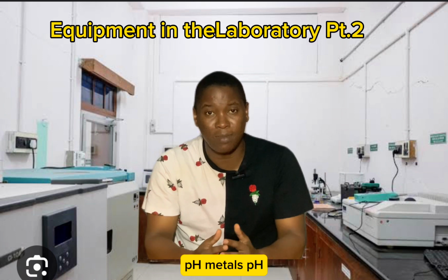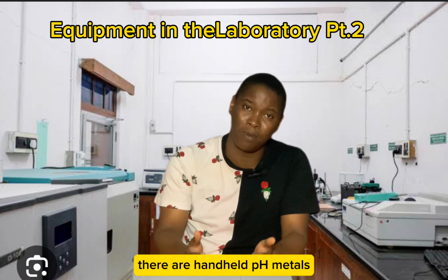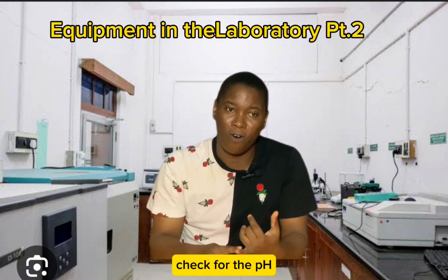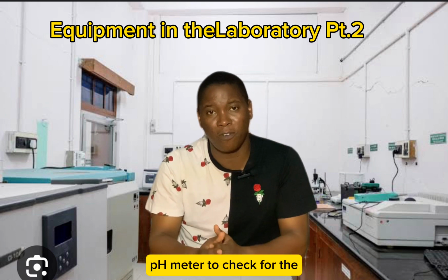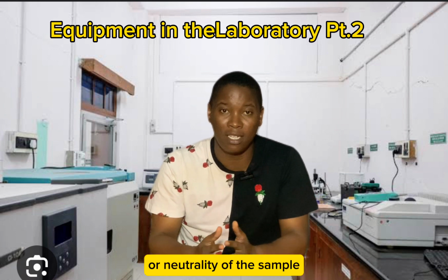Now, we also have pH meters. pH meters are important. There are many different kinds of pH meters. There are handheld pH meters. There are many other different kinds. And the important thing is that it's used to check the pH of a sample, the solution, the acidity or the alkalinity or neutrality of the sample.